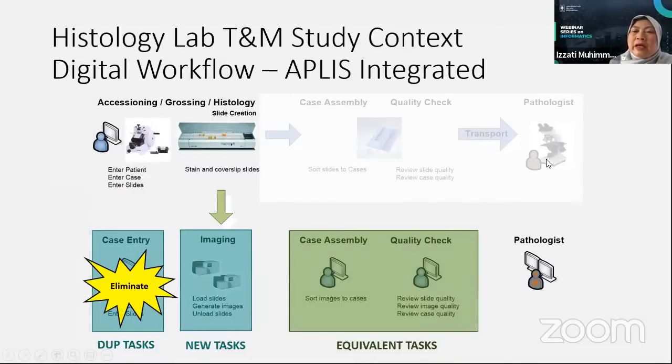To do this experiment, we put a high-resolution CCD camera mounted on the microscope available in the laboratory.